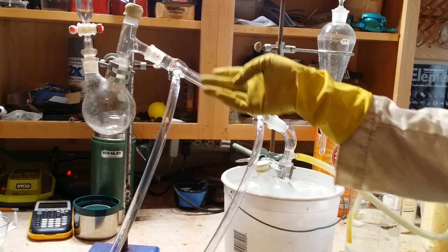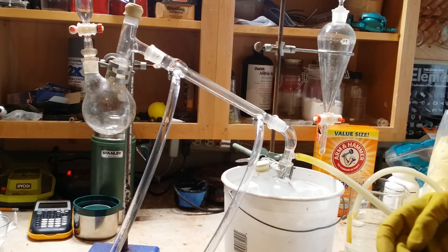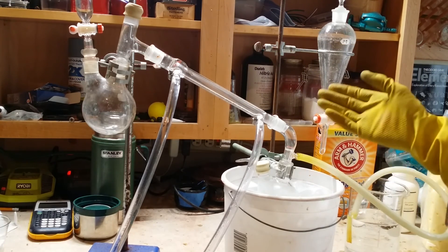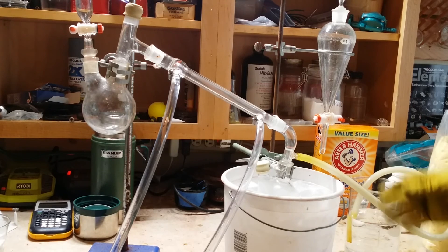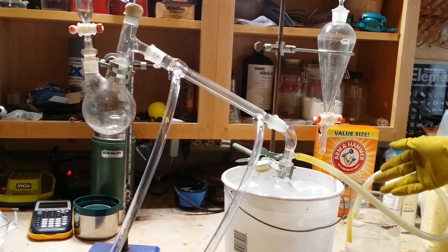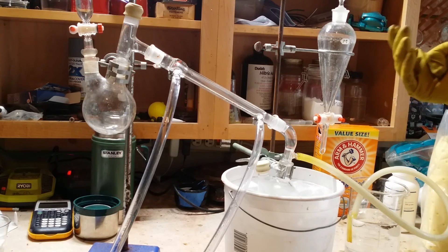This condenser tube will have cold water flowing through it, and it has a separate tube within it that the bromine vapors will pass through. The bromine will condense to a liquid and fall into the collection flask, which is immersed in ice water so that the bromine will stay liquid. I'm heating a closed system, so I need to give the vapor somewhere to escape should it pressurize. This hose leads to a beaker full of sodium bicarbonate solution, which will convert the bromine back to sodium bromide so no toxic vapors can escape.